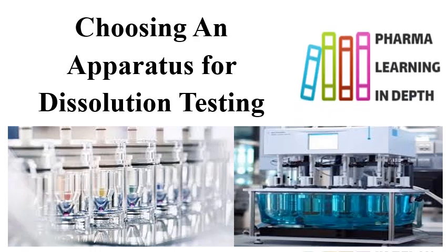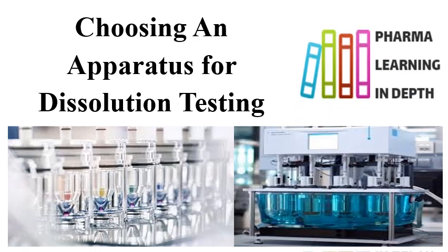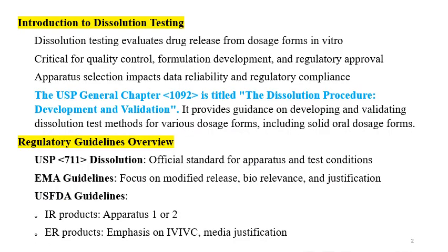Selection of the dissolution test apparatus is crucial in the dissolution method development. The selection of dissolution testing apparatus depends upon the formulation design. There are various dissolution test apparatus available. These are given in the USP and other pharmacopoeias. USP provides 7 types of apparatus, and each apparatus has specific features.